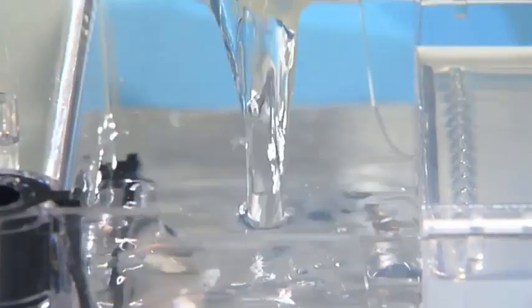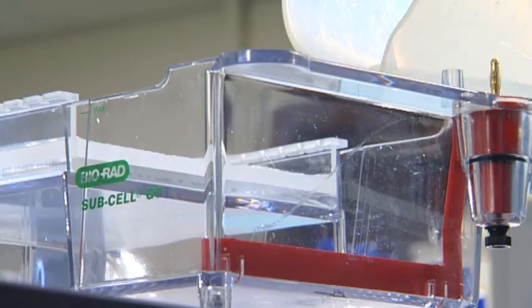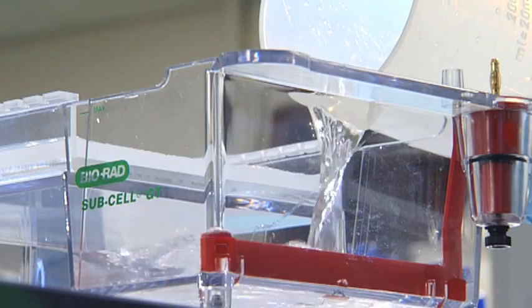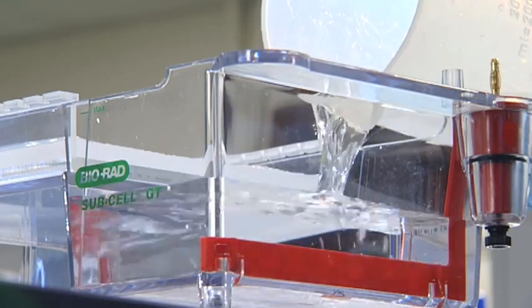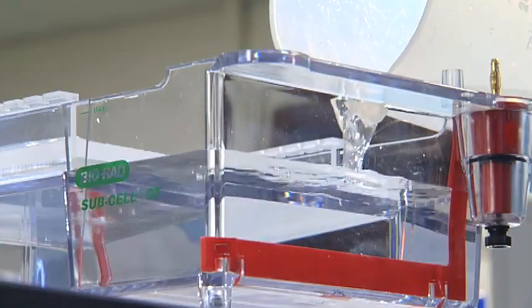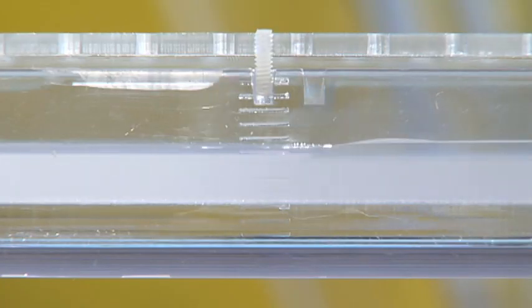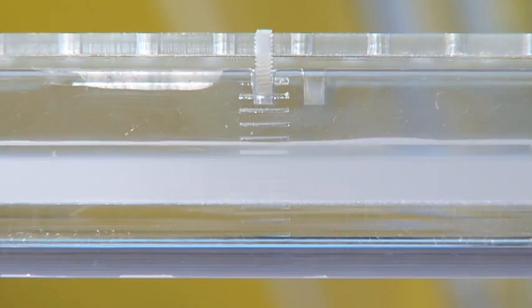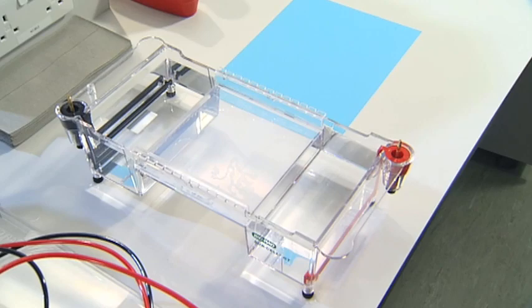Add buffer solution to the reservoirs at each end of the gel tank. Keep adding buffer until the liquid is about 2mm above the surface of the wells in the gel. This will make the gel easier to load and ensure the appropriate current runs through the gel. You'll be able to see the wells more easily during loading if the gel tank is on a dark background.